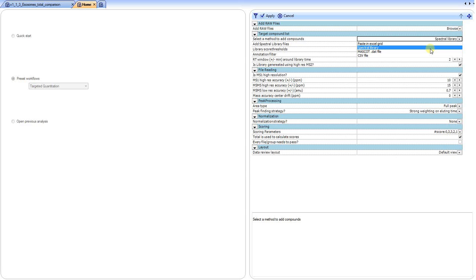These provide you an opportunity to import results that were created from another searching algorithm. The benefit of the spectral library is that you're providing all possible protein and peptide information into Pinnacle, which it will then use to process all of the raw files that you've provided.